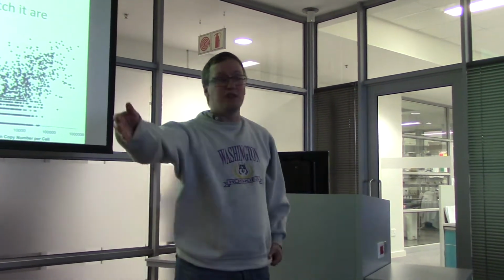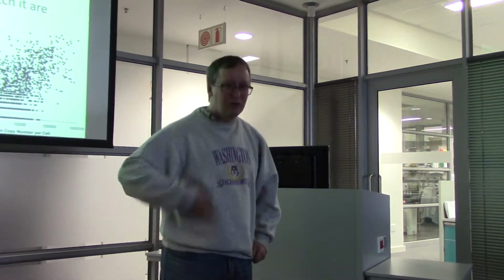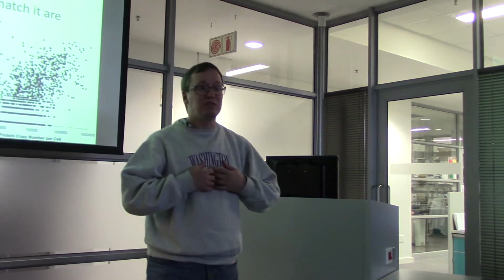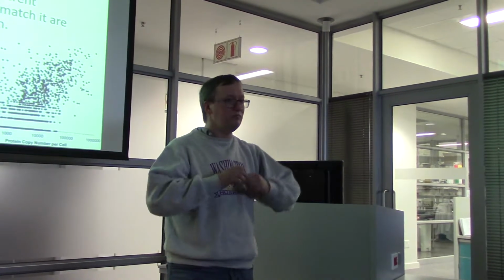But imagine that you have another student across the class who's much more introverted than that student, but very, very smart, right? That person is not likely to be clamoring with their hand up in the air, but they're a person who could illustrate that she or he understands that answer too, right? So you can imagine that this clamoring for attention can cause some ions to get a disproportionate amount of attention. But in this case, some proteins get a disproportionate amount of attention.